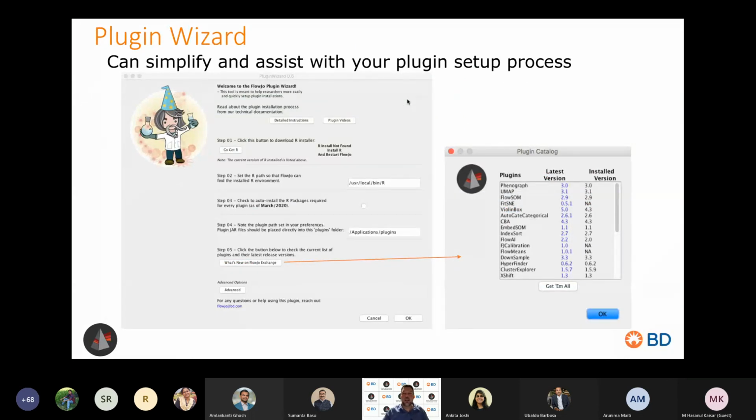Which could be a returned set of derived parameters. It could be a visualization. It could be cleaning up data and giving you a new population downstream of your sample. And so don't be too scared. Our applications team is here to help. My tech support team is here to help, and I will always be here to help as well. Don't be afraid to ask questions when you're new to this stuff.